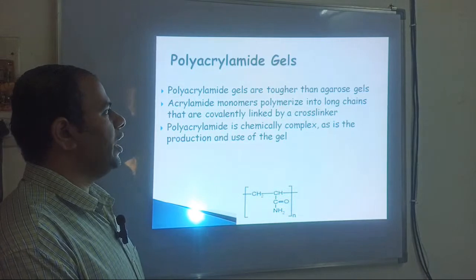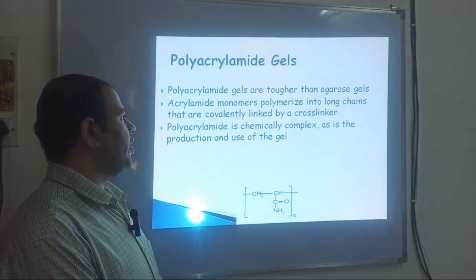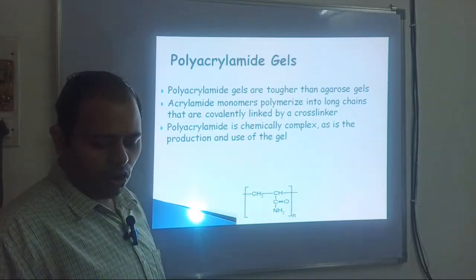Now the polyacrylamide gel. These gels are tougher than agarose gel as they are formed by two different monomers, that is acrylamide and bisacrylamide. Okay, it forms the cross linking.